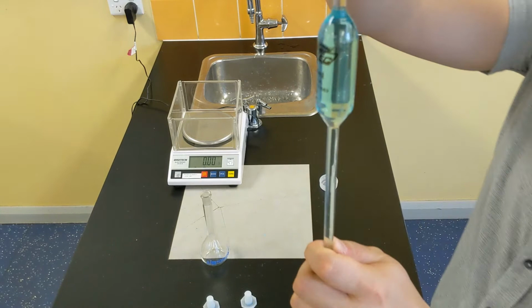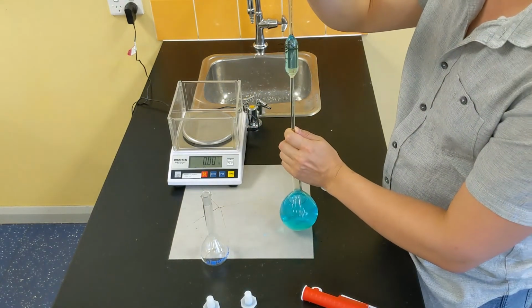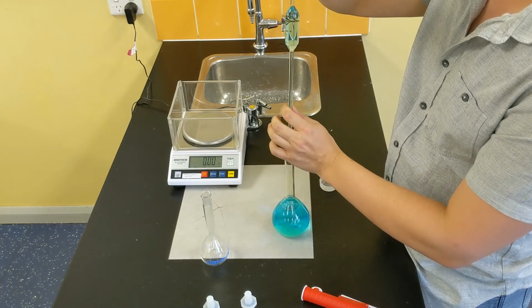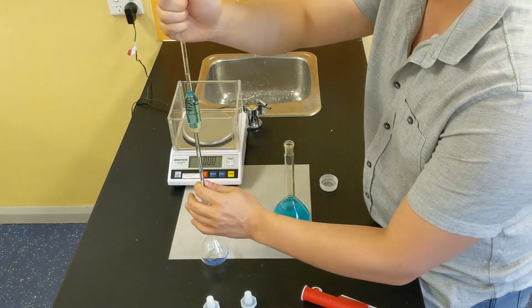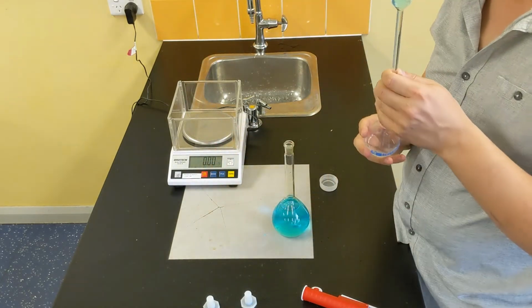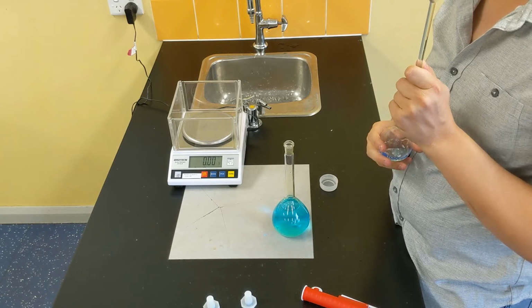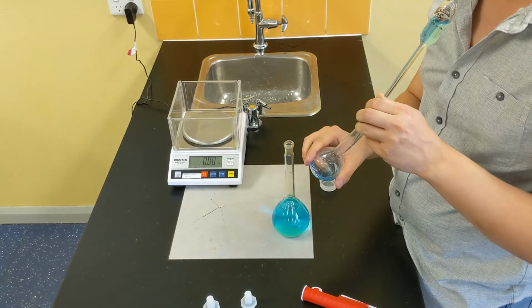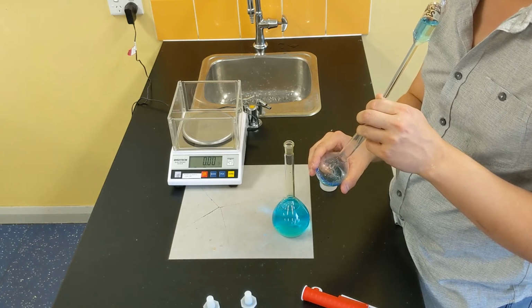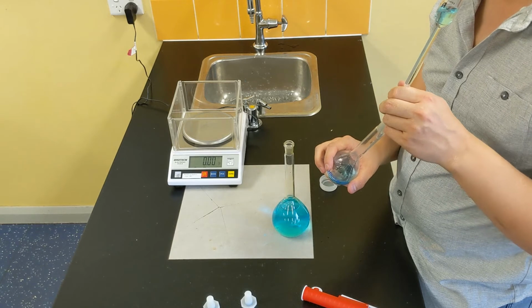What I'm then going to do is let out liquid, and it's a little bit hard to see. Again, I'm lining up the level of the liquid with the mark that's on the pipette. Again, I'll show you that when we get into class. And then draining that out into this volumetric flask here. Now this one measures out exactly 100 mils. So I'm putting 25 mils of solution into here exactly. And then we're going to be adding a further 75 mils of water into the volumetric flask in a second.